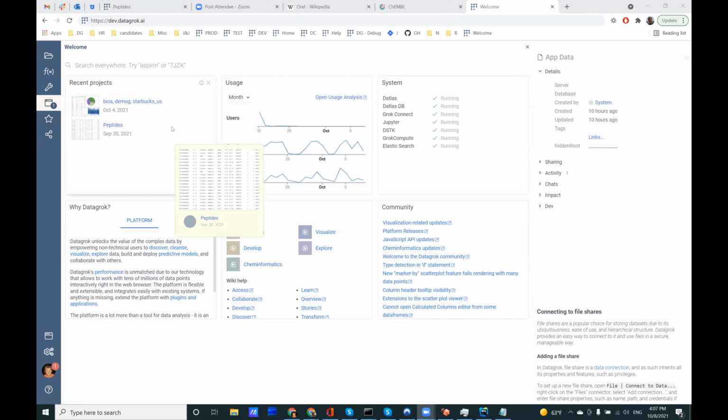We tried to structure these widgets in such a way that the most useful ones would be on top, and they are also customized according to whatever packages a person is using and your personal preferences. So this is all customizable. These six that you see are more or less default, but each package can introduce its own widgets that would appear here.